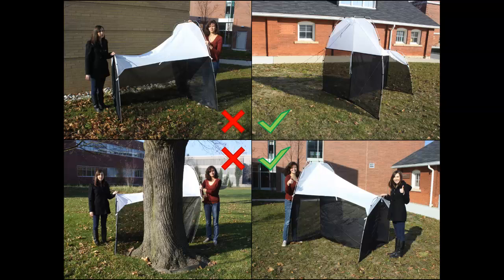Next, consider trap placement. Position the trap in a relatively open area so that insects have flight access to either side of the trap. Do not place the trap so that either one or both sides are directly up against a tree, shrub, or building.